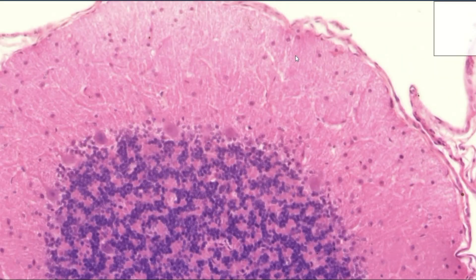This is a folium at higher magnification showing only gray matter. The outermost layer, in spite of its relatively pale staining, belongs to the gray matter and is called the molecular layer — it is relatively cell poor. On the top we can see the pia mater. Under the molecular layer we see one layer of quite large perikarya, which belong to the Purkinje cells, giving this layer the name Purkinje cell layer.